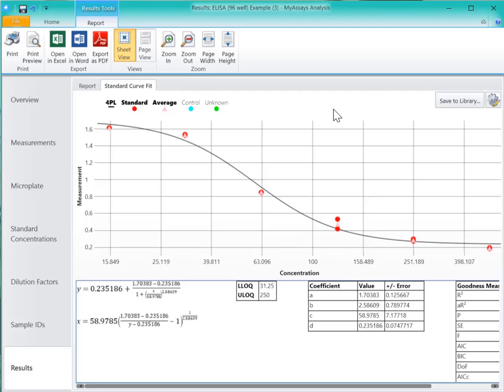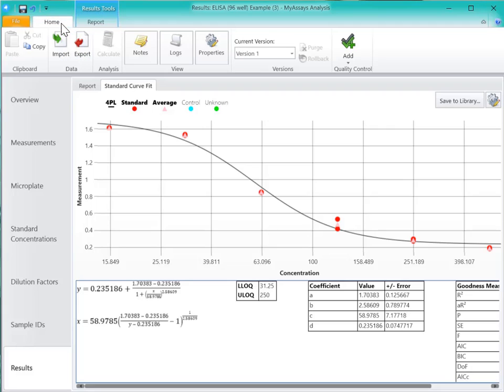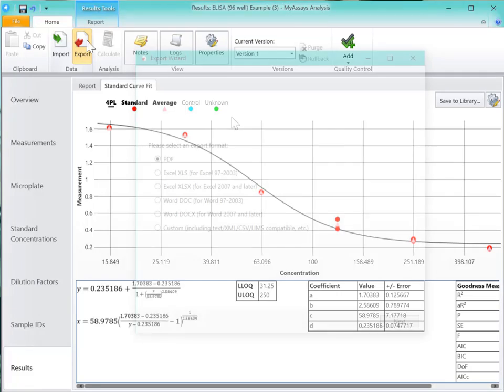We can also export our data using these options to open an Excel, Word, or export as a PDF, or we can use the Export Wizard to export to a custom format.